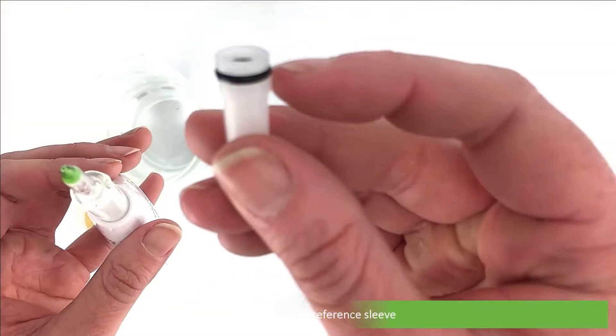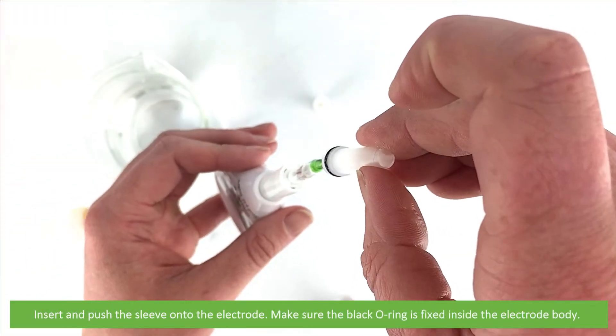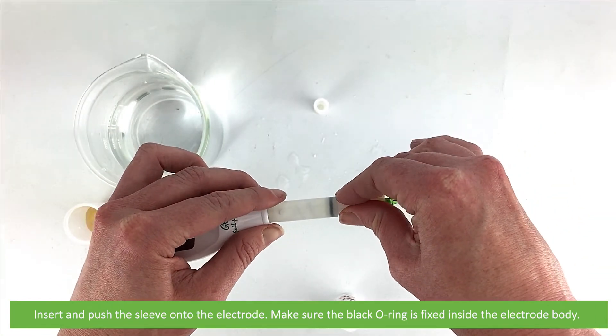Then replace the reference sleeve. Insert and push the sleeve into the electrode. Make sure the black O-ring is fixed inside the electrode body.